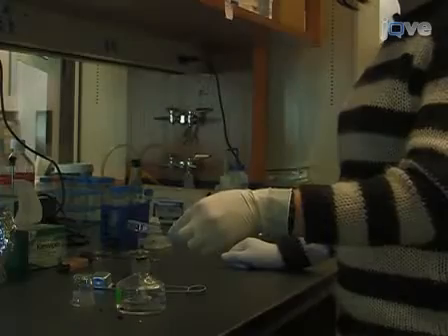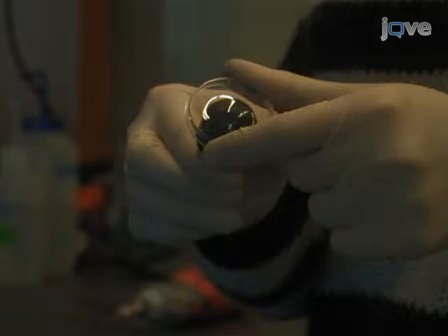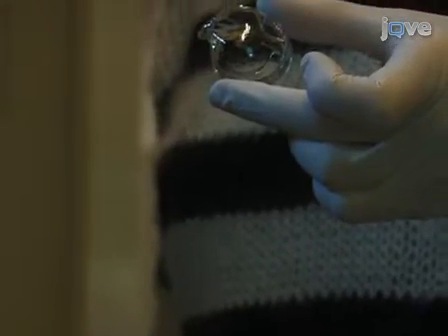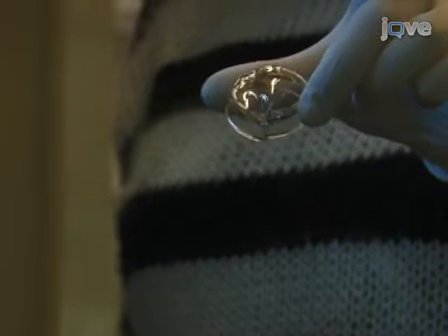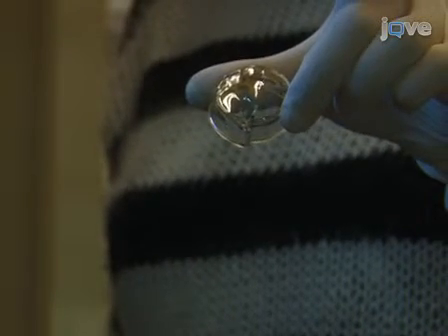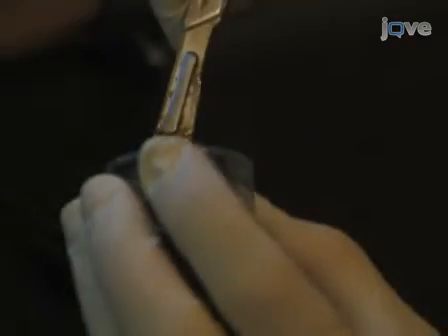Wearing latex gloves, begin the fabrication of the Mammary Imaging Window, or MIW, by heating up a 5 to 10 cm tissue culture dish and creating a curved surface by pushing a rounded, hard object, such as a 1-inch Dremel bit, against the dish. Cut out the centre of the dish using a heated razor blade.